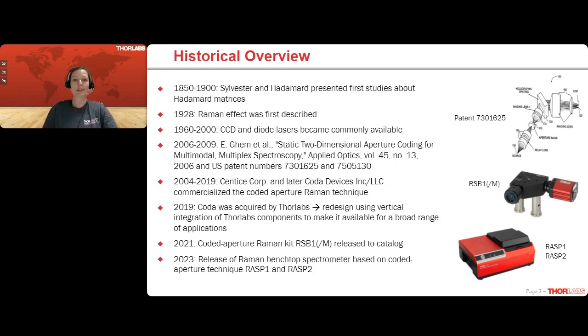After all of those technologies were available, a group mainly at Duke University, and I would like to point out Jem et al., provided some publications, proof of concepts, and also filed some patents. On the right-hand side, you can see a scheme out of one of those patents in which you can see a beam path from a light source through some guiding optics and an aperture mask, to which I will be referring later on, a grating, and a CCD camera for imaging purposes.